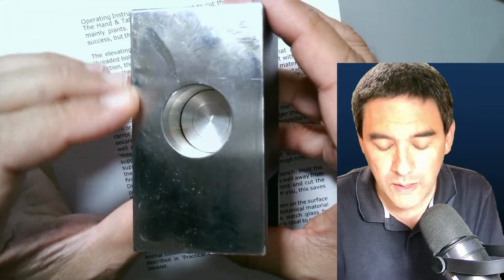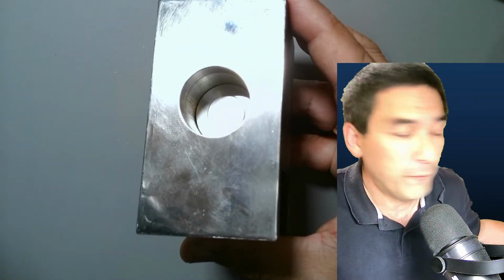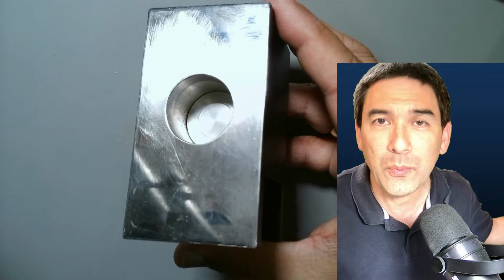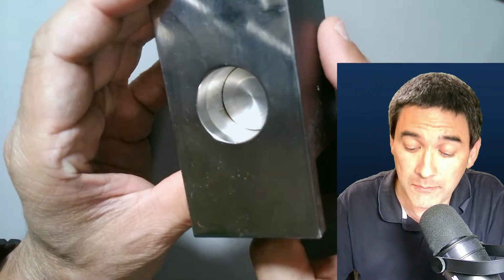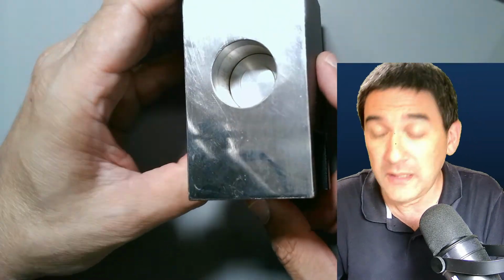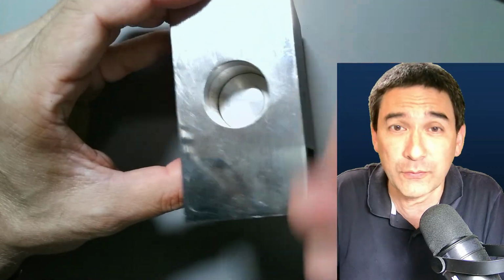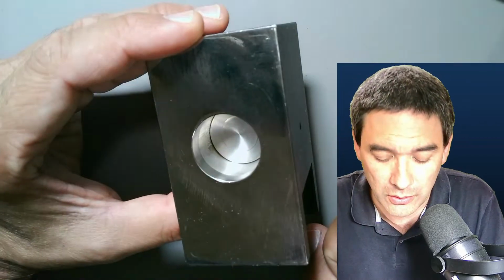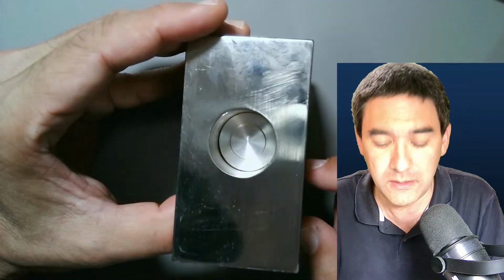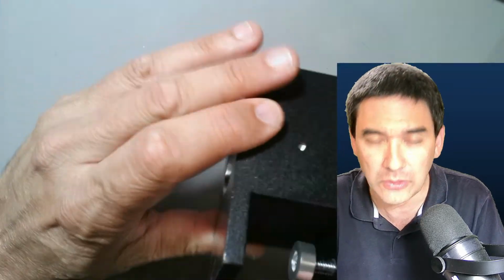Okay, so I think one of the important things is that these handheld microtomes, of course, cannot compete with the big commercial microtomes that are used for making commercial specimens. Obviously, they cannot compete. But honestly, they kind of do their job, and you have to do a little bit of trial and error, because if you make several sections, some of them are going to be better than others. So for hobby purposes and for casual observation, definitely something to have a look at.